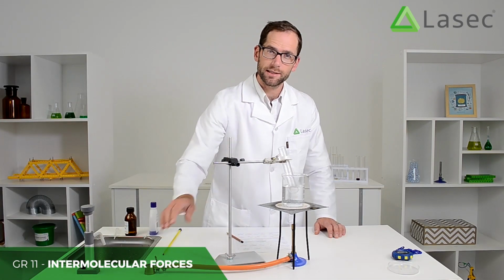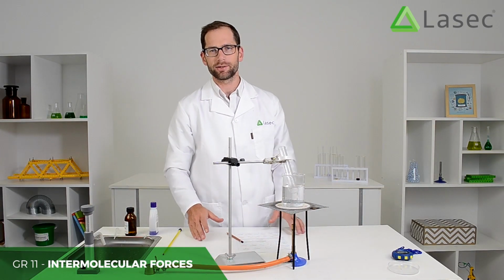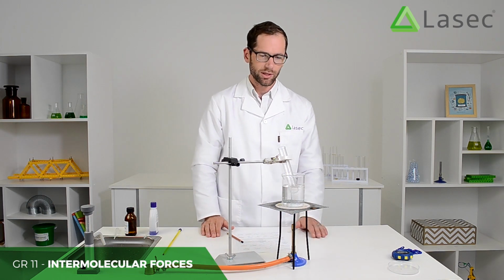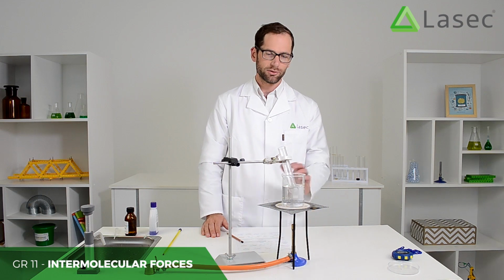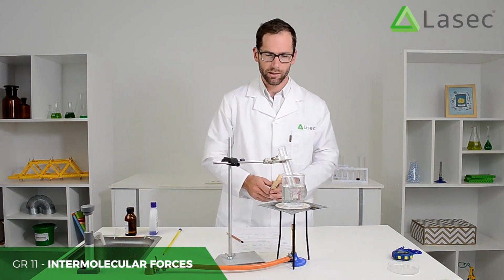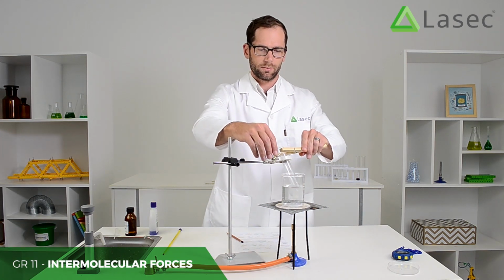So now I've got that nicely bubbling away at 82 degrees Celsius, consistently bubbling at 83. So we've reached our boiling point of ethanol, and I want to remove it now. Just remember, it's hot. Make sure the learners don't burn themselves when working with hot apparatus.